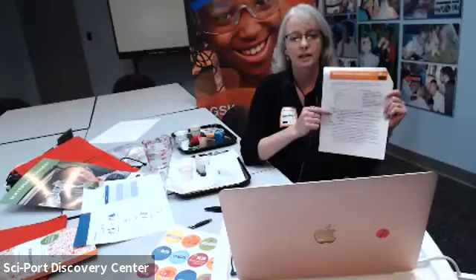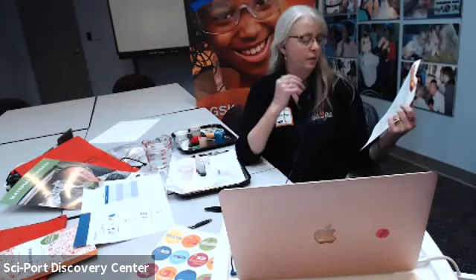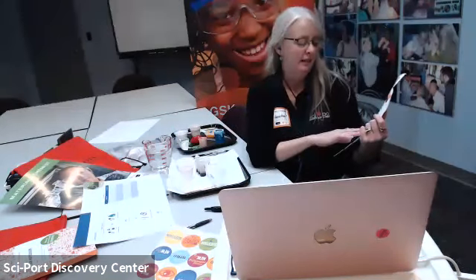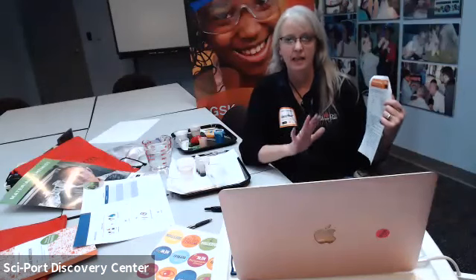First, safety. Things we need to keep in mind in the lab. In your materials chemist activity guide, the safety guidelines are listed. Number one, don't touch your face or your eyes when you're doing an experiment - some materials such as borax could irritate your skin or eyes. Wash your hands with soap and water when you finish. Don't taste the materials for any reason - we don't eat or drink anything in the laboratory, not unless it's a special food chemistry lab.